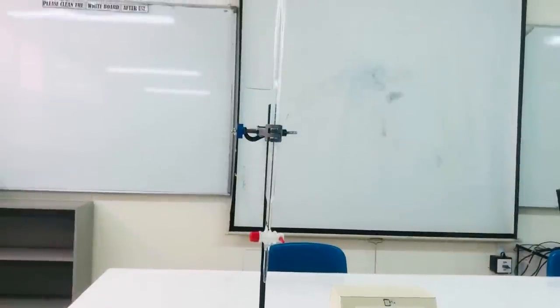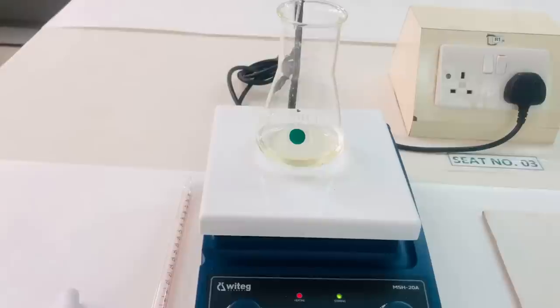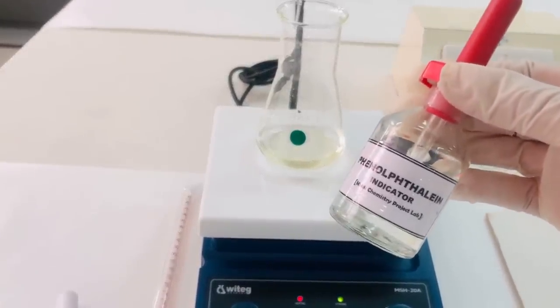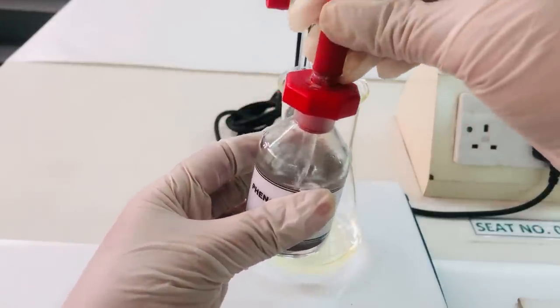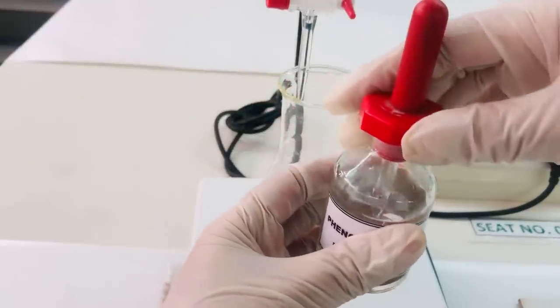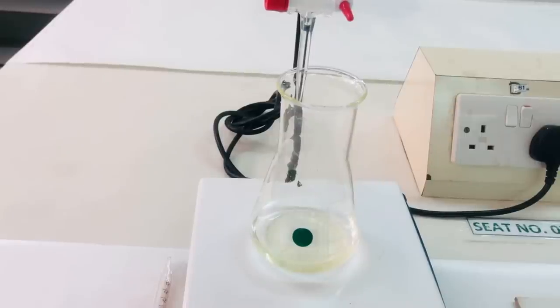In order to prepare for the experiment, we have filled the burette with standardized NaOH solution. Place the conical flask on the hot plate and add to it 1 to 2 ml of phenolphthalein indicator. Allow the solution to warm up to 40 degrees so that the solvent and the oil mix together.